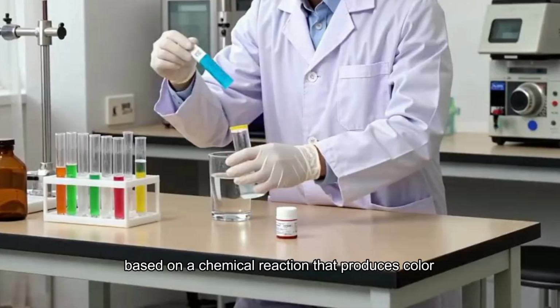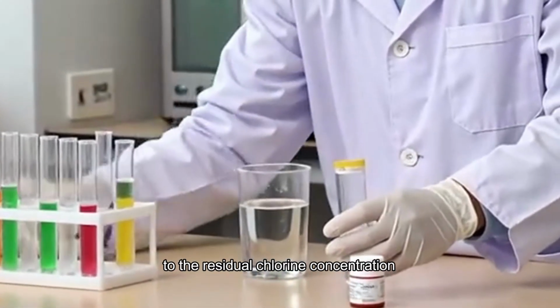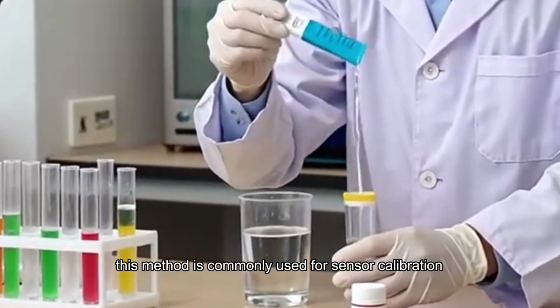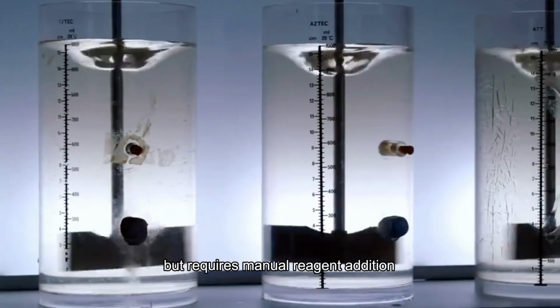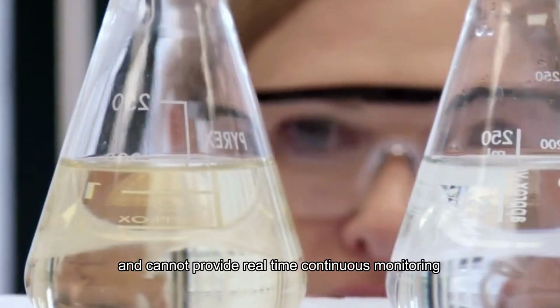Colorimetry, based on a chemical reaction that produces color, with the color intensity proportional to the residual chlorine concentration. This method is commonly used for sensor calibration or emergency spot checks. It offers high measurement accuracy and strong interference resistance, but requires manual reagent addition and cannot provide real-time, continuous monitoring.